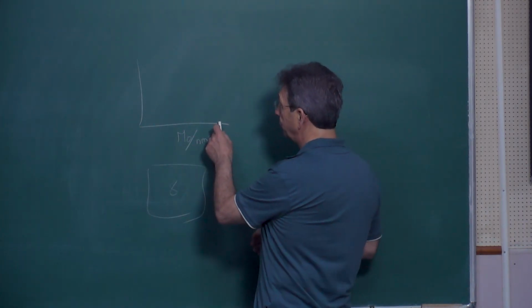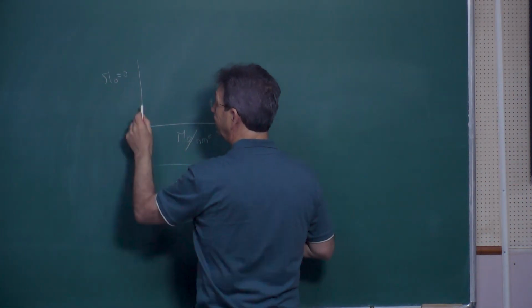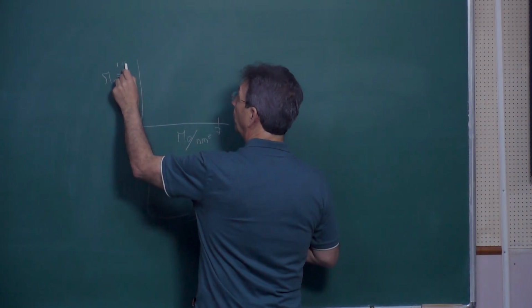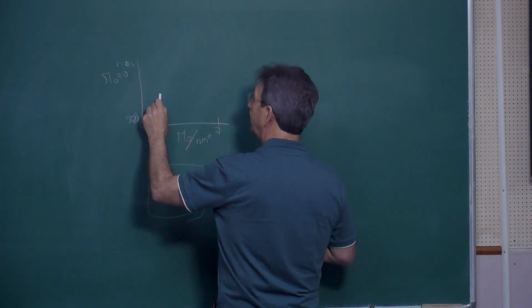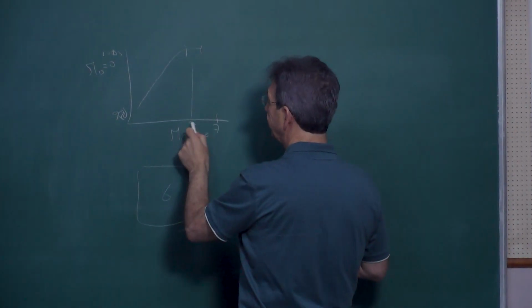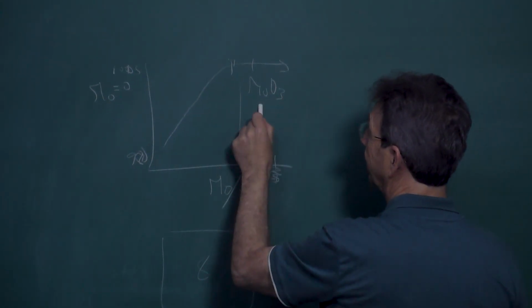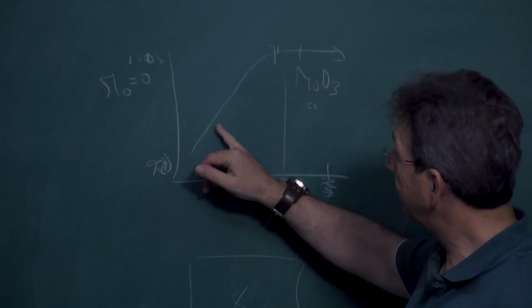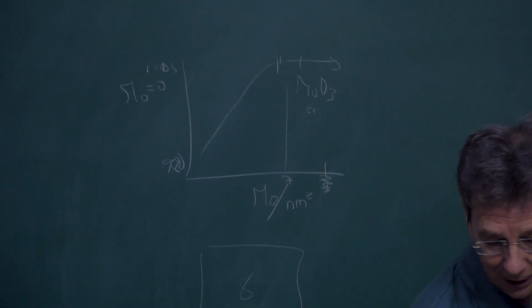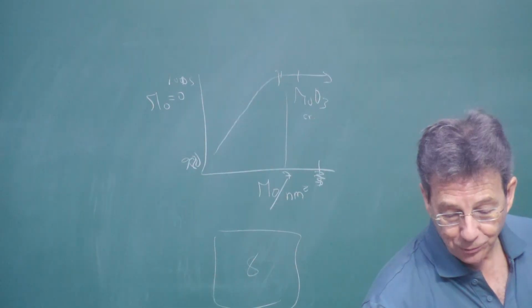Now, typically up to 6, 7, you will get a monolayer. So actually the frequency of the molybdenyl vibration for the dehydrated samples will increase from 980 all the way to 1005 or whatever, little by little until it levels off. At that moment is basically when you get the monolayer coverage. And above that value, what you will get is molybdenum oxide crystallites. But over here, it will be isolated and increasingly polymerized. And the molybdenyl bond frequency will be progressively increasing, as you can see here, from 990 to 1006. Okay. Remember that infrared will not allow you to see things in such detail.